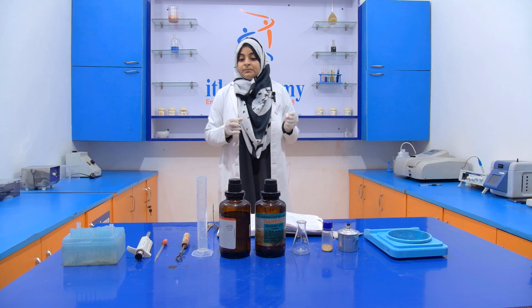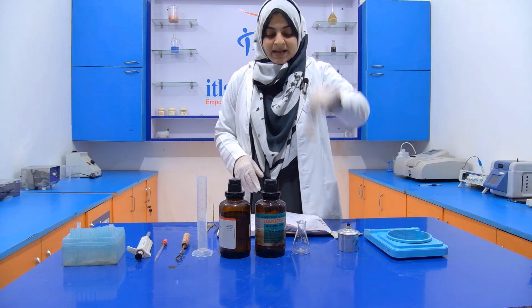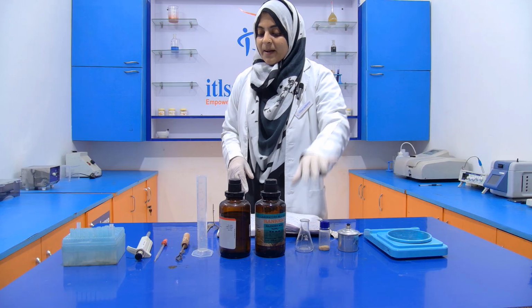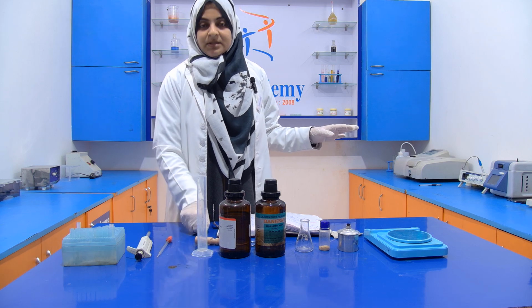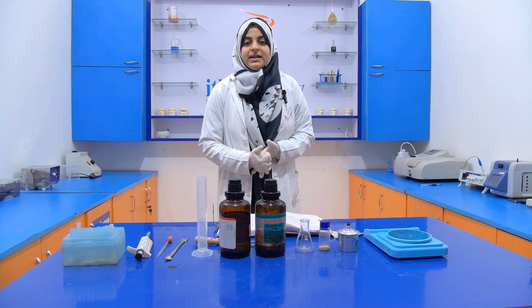Now, we require a weighing balance, asafoetida as a sample, a conical flask in which we are going to perform the experiment, then we require a dropper, and we require a spatula. So this is the requirement for performing the experiment.